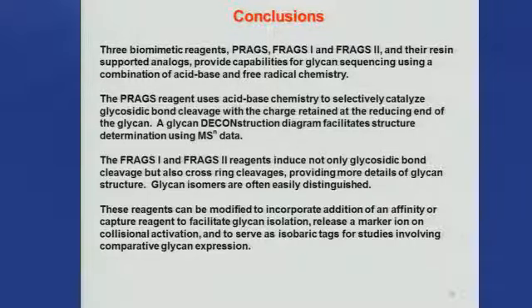So in conclusion here, we've got these biomimetic reagents, the proton reagent. And let me emphasize with the proton reagent, this ability to do MS to the nth is really quite useful.